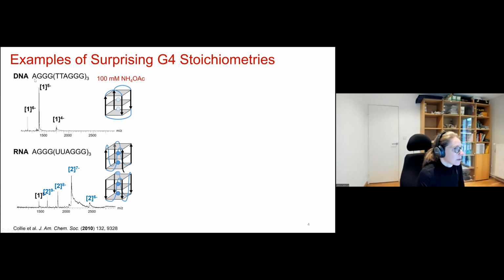principle. For example, this is the example of a DNA G-quadruplex forming sequence from the telomeric sequence with 4 G tracts. In the past, we have been working a lot with ammonium acetate, where G-quadruplexes can fold and which is also perfectly compatible with mass spectrometry. So DNA in these conditions folds intramolecularly.